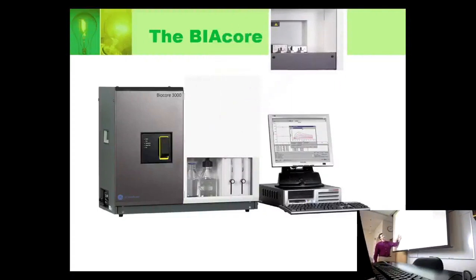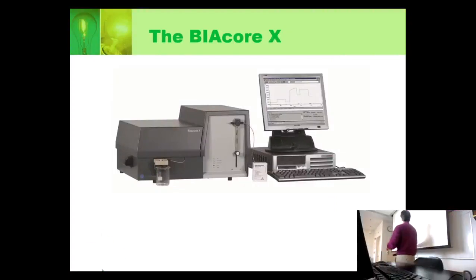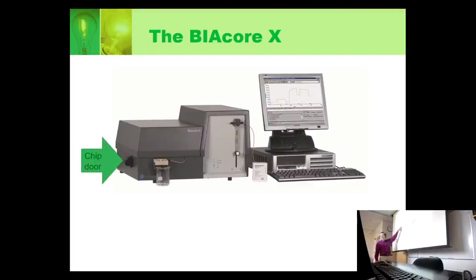But what we have is basically this without the needle. We have a BIAcore X, which is not a BIAcore 3000. Here it is. You don't see any needle on it. The chip goes in here. But the optics, the laser, the prism and stuff like that, are not quite as good, but almost as good as the optics in the more recent ones. So they've upgraded the optics slightly, but the main thing they did is add an auto-sampler needle.